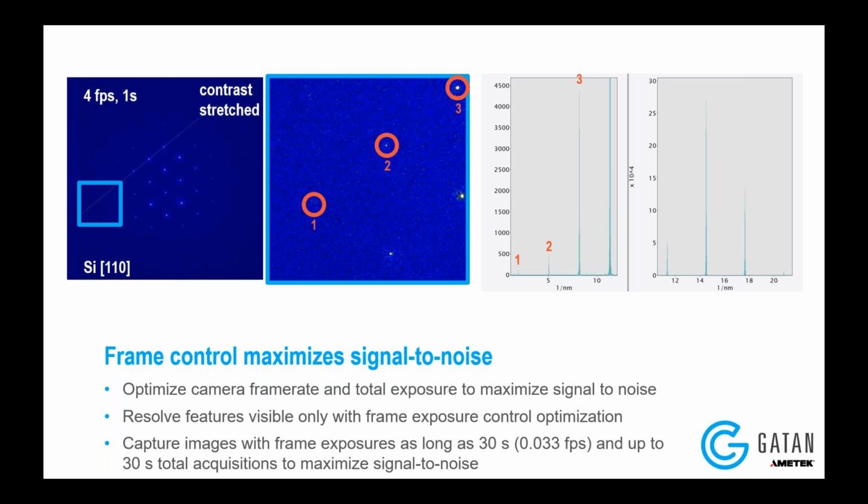So you can see this spot number 1 has as few as 100 or 200 counts in total intensity in the line plot region that we're using, and other spots in the line profile can have over 250,000 counts in these diffracted spots. So it's showing the type of dynamic range of the signal intensities that you can acquire by the camera.